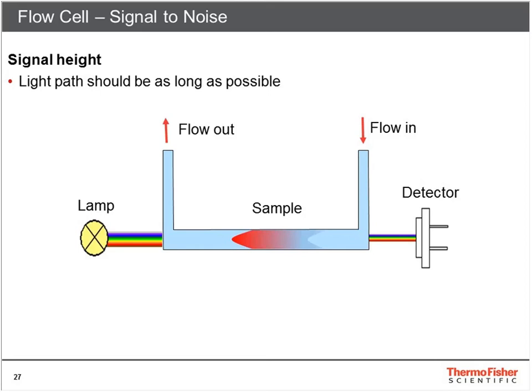To use this, get as much light as possible through the flow cell. 4 times light is the same as half the noise. To decide what cell to choose is difficult because we want a long, narrow cell for sensitivity, and this gives scattering effects. A narrow cell also makes it difficult to get enough light through it.